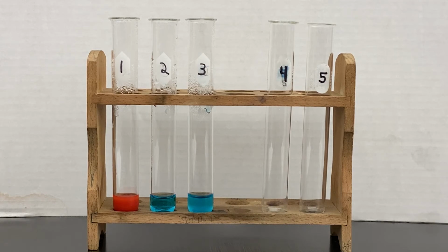So as you guys can see, after 2 minutes in the hot water bath, we have a color change in test tube 1 only. The Benedict solution that was originally a bluish color has turned a reddish orange color, a very vibrant color in that first test tube. Okay, so I'm going to go ahead and clean these test tubes out.